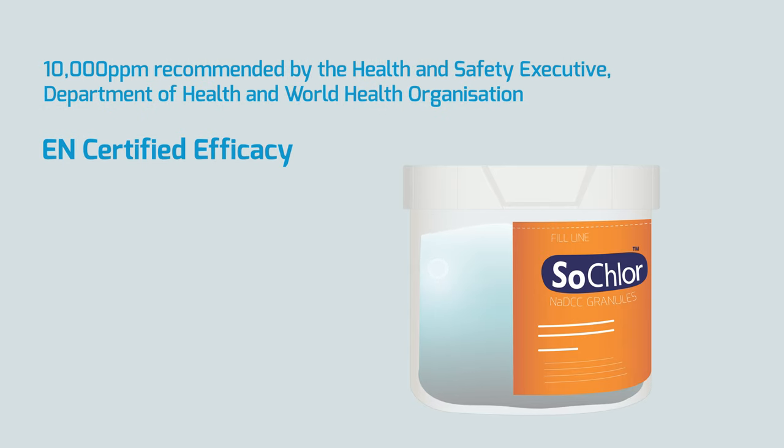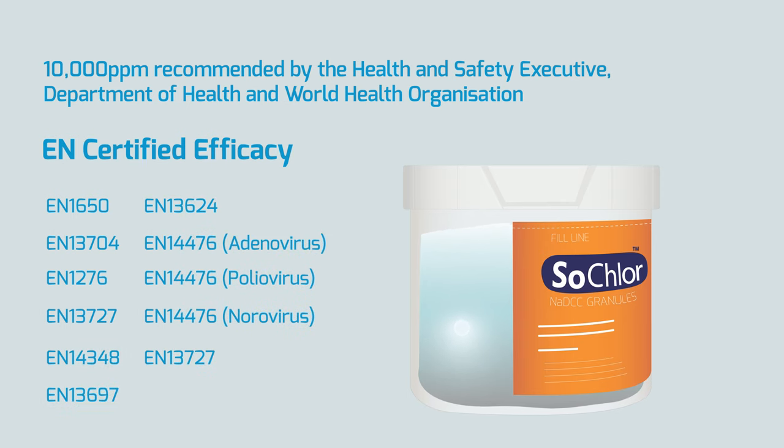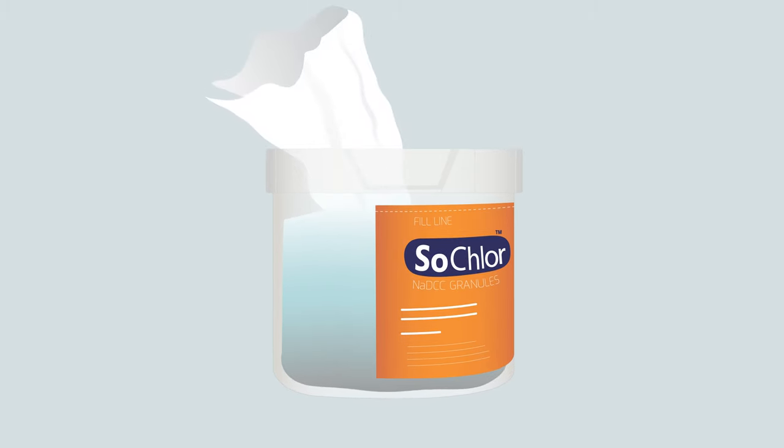The tablets should now have dissolved in the water. This has created a 10,000 parts per million solution, as recommended by the Health and Safety Executive, Department of Health and World Health Organization. Fully effective against bacteria, spores, mycobacteria, fungi and viruses. Wet the paper towels provided in the SoClor 10,000 ppm solution.